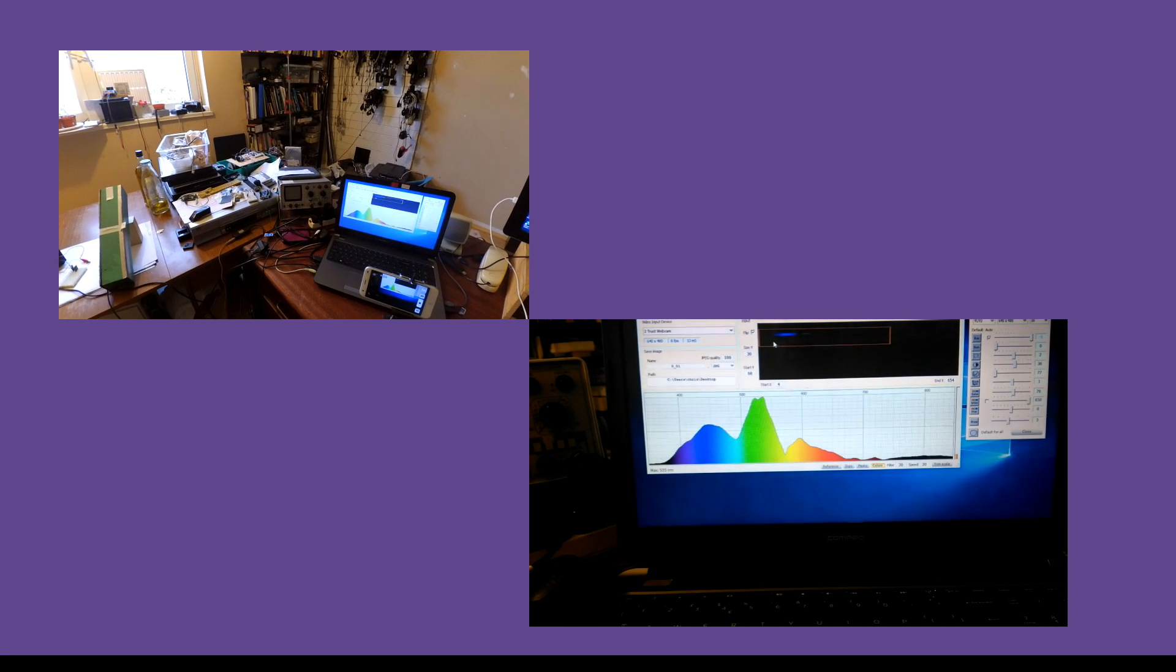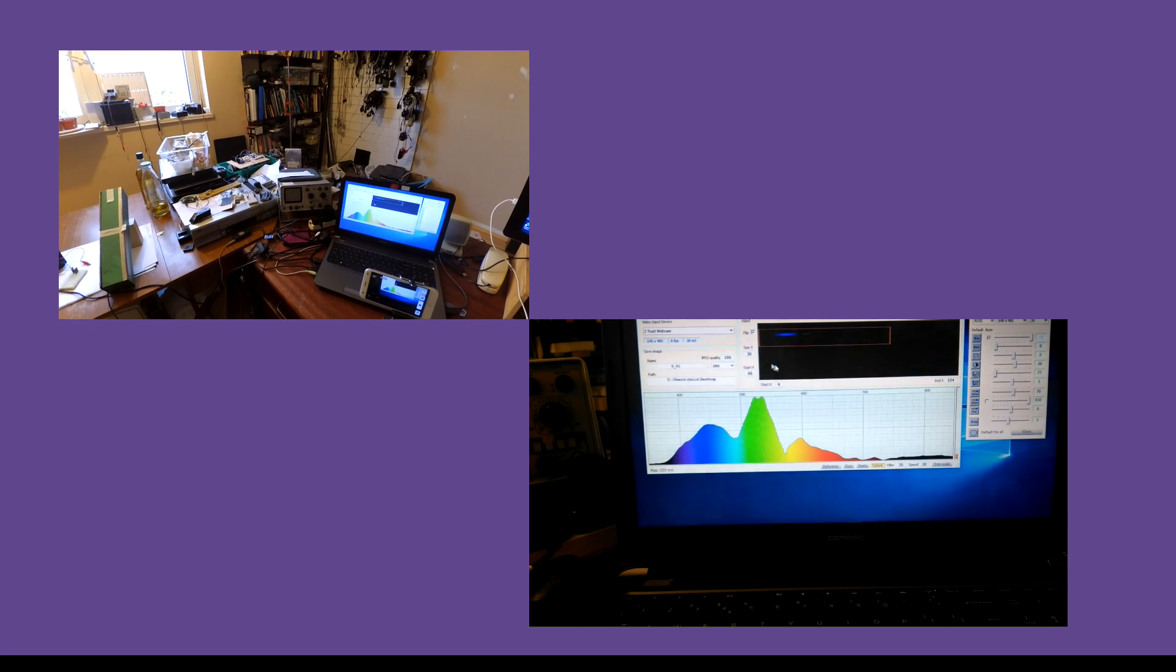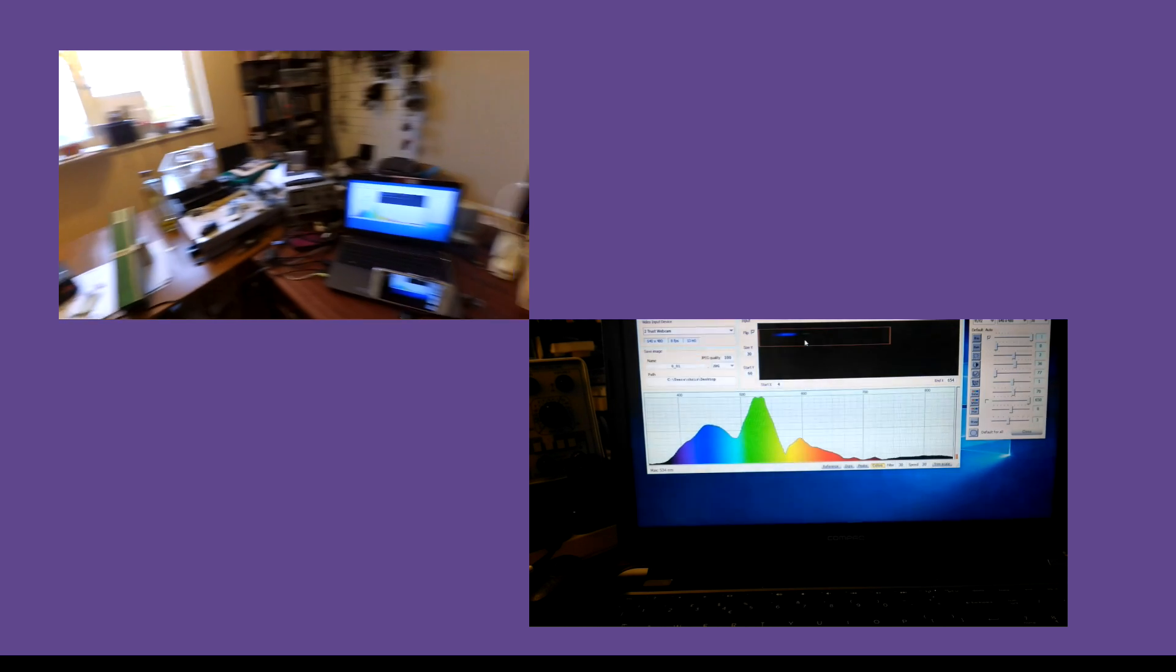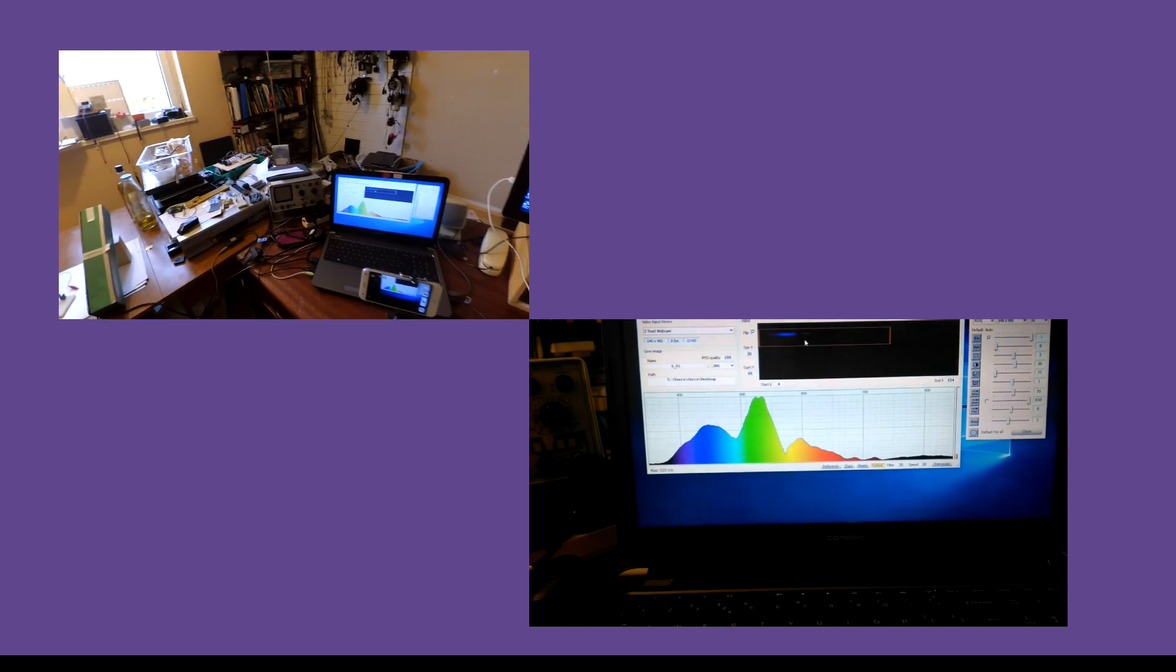But this needs calibrating, because this software doesn't know the precise geometry of the webcam, how long the device is, the optics of the webcam lens, the angle that it's at, and so on—bits and pieces.